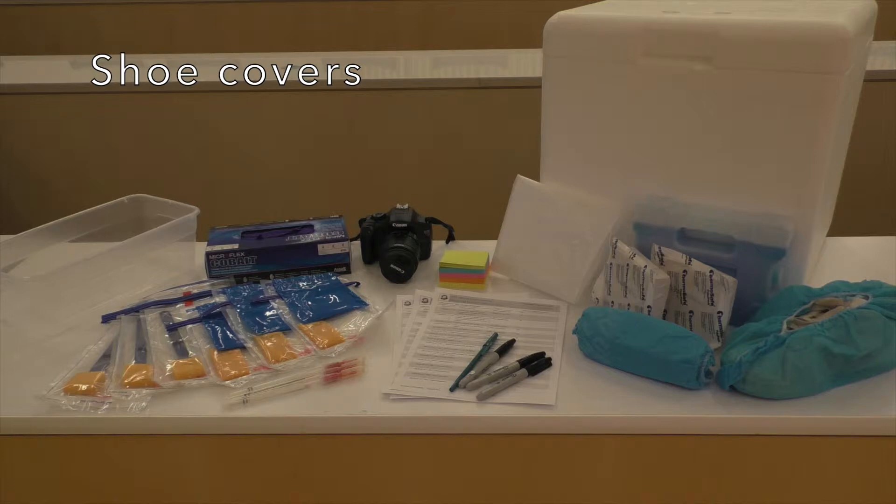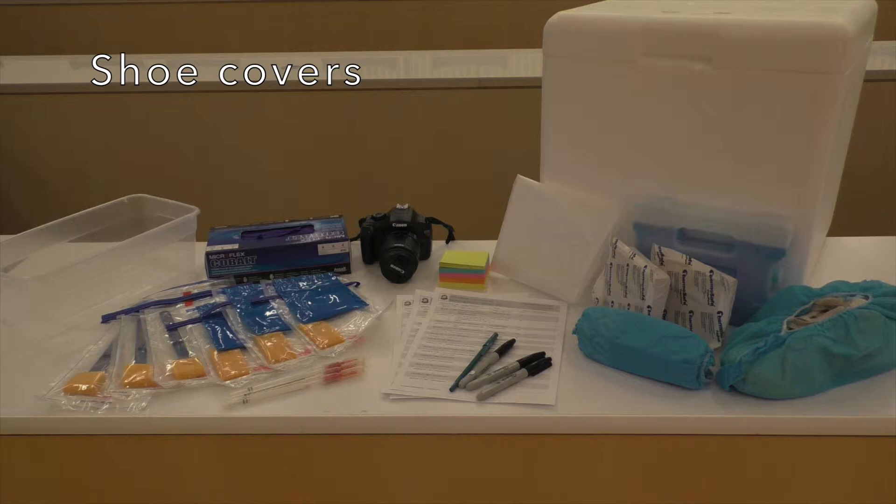For example, you may want to wear shoe covers if it is a required procedure in a facility or if you are worried that facility personnel may raise concerns about cross-contamination. You'll also need a container to transport all of your sampling supplies.